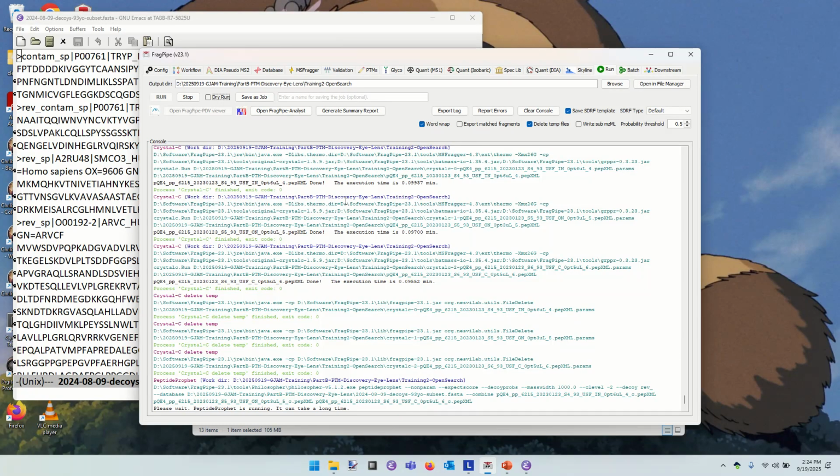And assuredly, doing an open search is going to build onto that search space quite a lot. Almost any peptide sequence can be compared to almost any MSMS if you have the right PTM shift added to it or subtracted from it. So open search is in large part throwing out the value of the precursor mass filter in doing these identifications of MSMS scans.